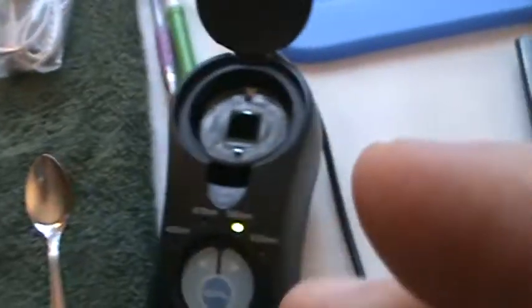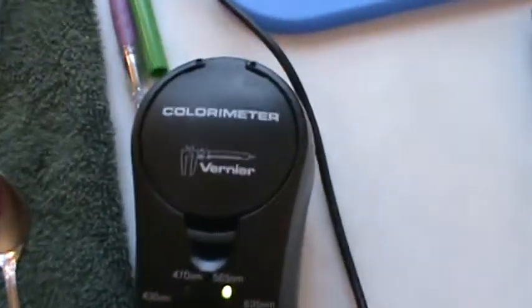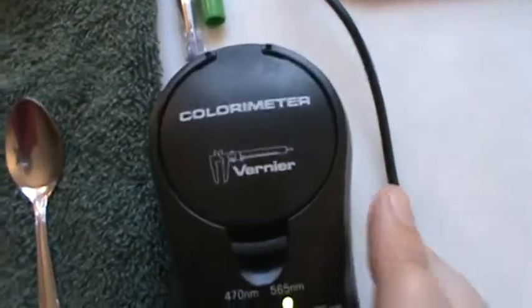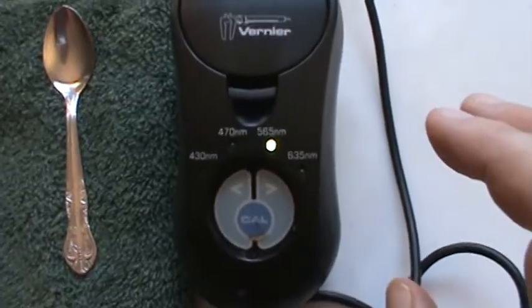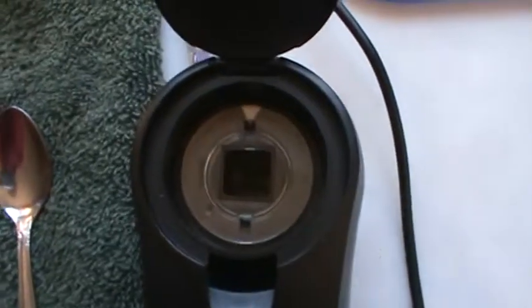this is actually just called a colorimeter. If you were working in a different kind of a lab, like with, you know, better technology, this would probably be called an absorbance spectrometer or spectrophotometer. Okay, but for here, they're just calling it a colorimeter, that it measures how much color or pigment we have in something. Okay, and what we're going to be using is this piece of equipment here.